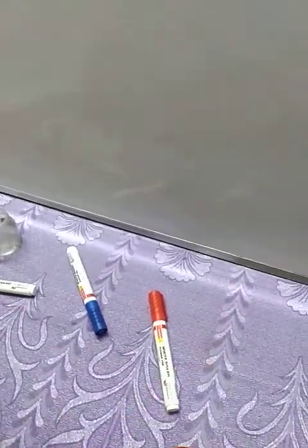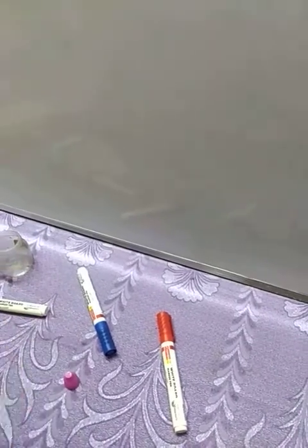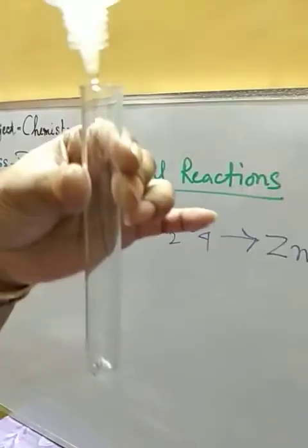This we are taking in this test tube, and here we are going to add a few drops of dilute sulfuric acid. So here I am adding this.